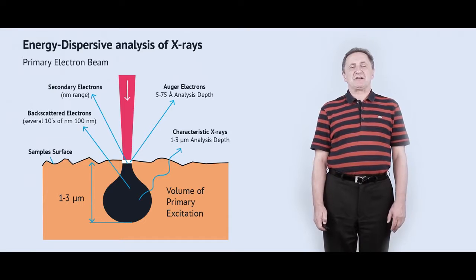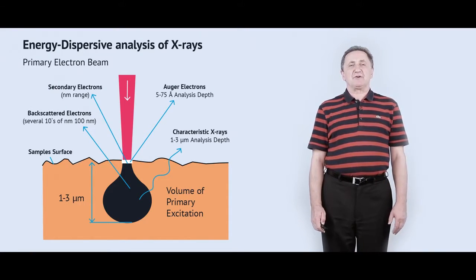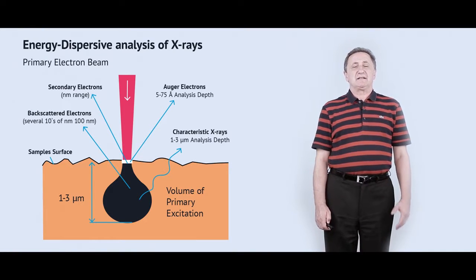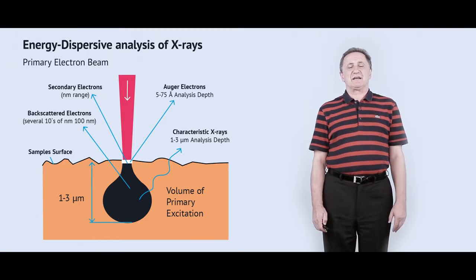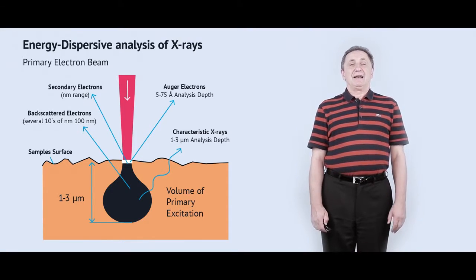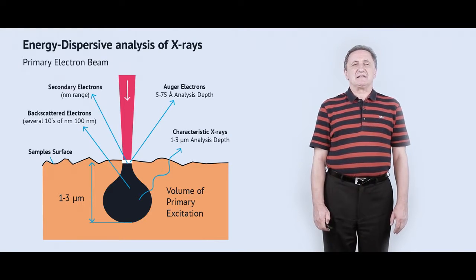And we have a special detector which detects this emission and measures its energy. The energy, as you understand, is strictly related to the electron structure of the element which we are investigating. So what is important here?